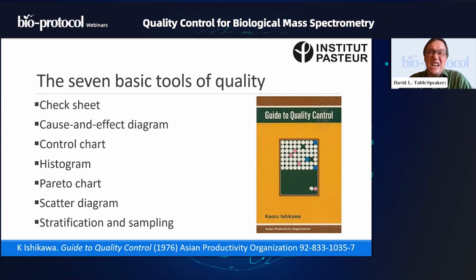After all, it was only, say, in the 1980s that people were doing their first experiments with tandem mass spectrometry for showing peptide sequences. But in fact, this book was transformative for lots of industries, and a whole lot of people who today call themselves quality control experts got some of their earliest training by reading this book. So I would really like to highlight Kaoru Ishikawa's far-reaching work, A Guide to Quality Control. And today we're going to talk about how it relates to making proteomics a much better quality controlled technology.